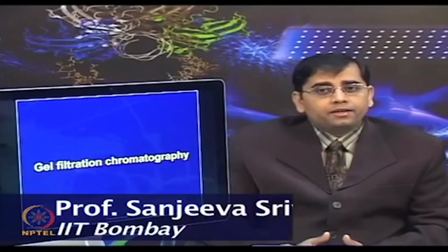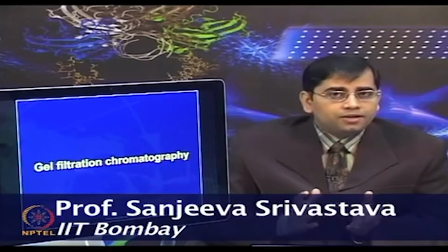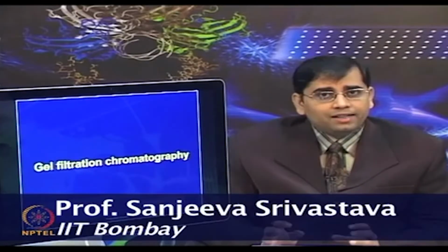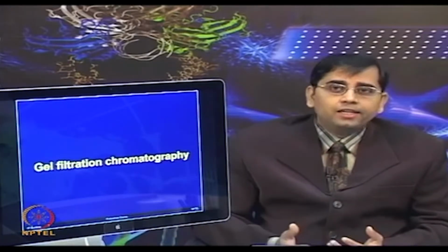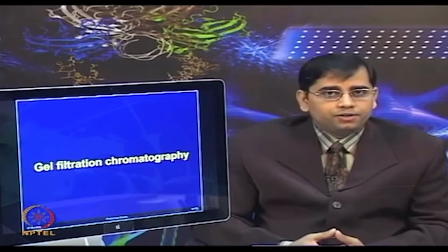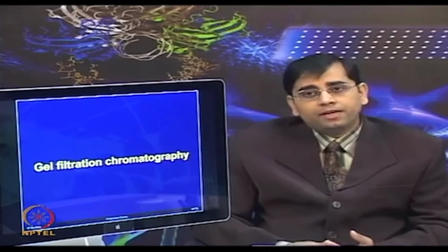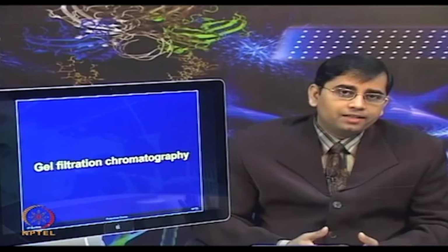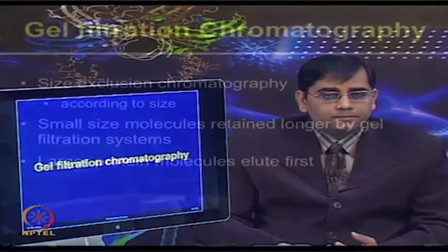It is used to separate a protein of interest from a protein mixture that are larger or smaller in size. If proteins are having similar sizes, then gel filtration or size exclusion chromatography is not an appropriate choice for protein purification. This method is also used for various proteomic applications when there is a need to remove contaminants such as salts and low molecular size detergents.